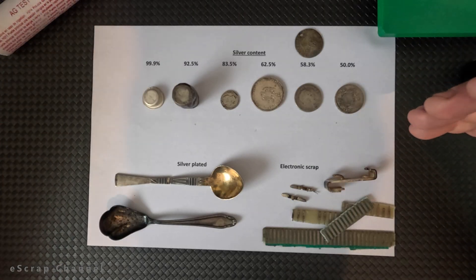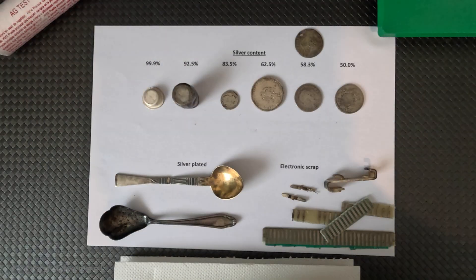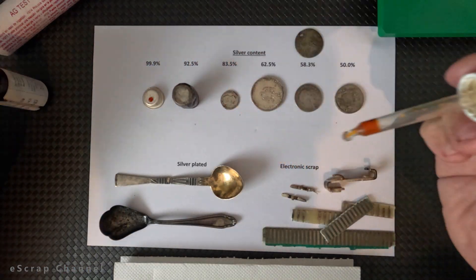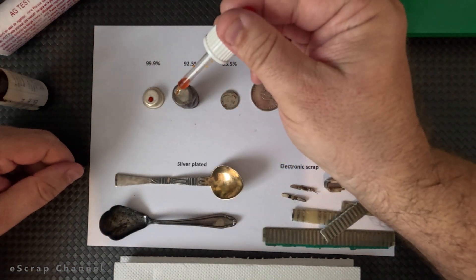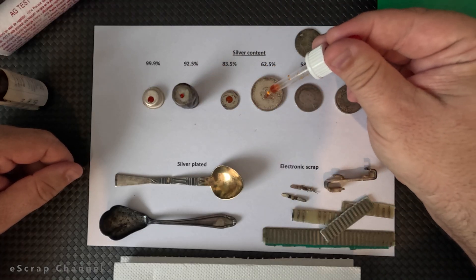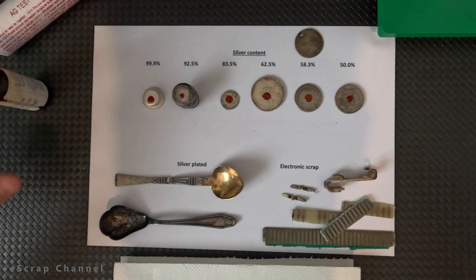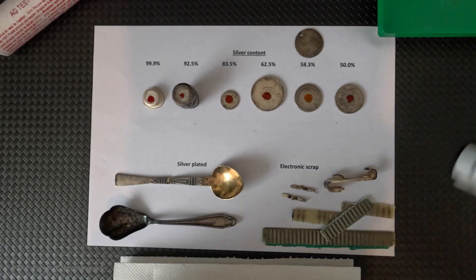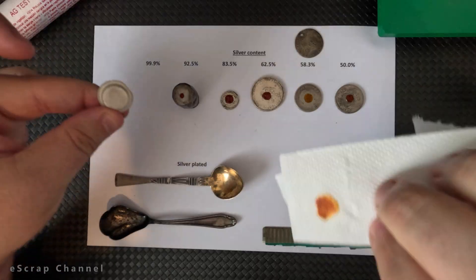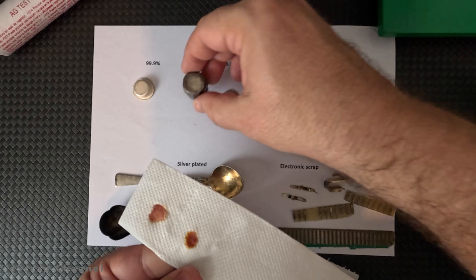Here on the top row I put coins and different silver objects that contain different amounts of silver. Let's put a drop from the testing solution to each of them. This is pure silver. This is 92% silver. This is 83% silver. This is 60% silver. This is 58% silver. And this is 50% silver. This is 64% silver. After that I will scratch these objects with paper and show you each of them what kind of coloration it gives.